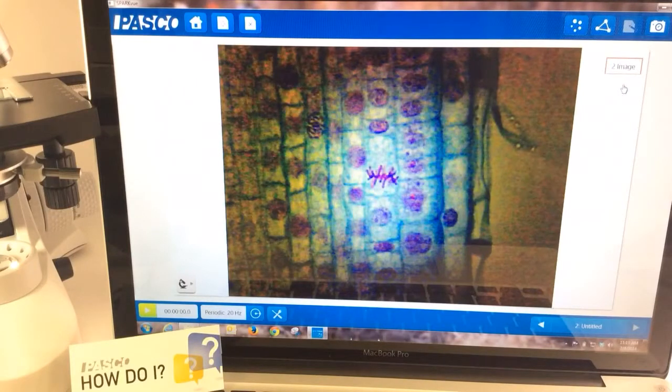with the image that I've captured of the cells, what I can do is open up my tools by going to the lower left and clicking on the ruler for measurement, and then I can click on the ruler again to make sure that it's active. And then really I can click anywhere on the screen and then I can adjust that line that I'm dragging across. So I want to make sure that it's a nice level line. I can drag the points by clicking within the arrows and making sure those go right to the edge.